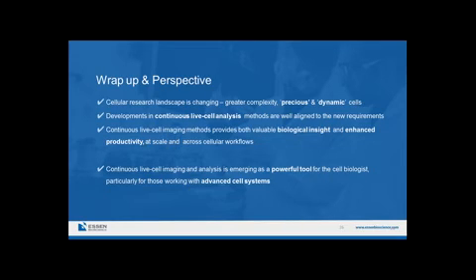The continuous live cell imaging methods I showed you provide both valuable biological insight as well as enhanced productivity, and this can be done at scale and across a range of different cellular workflows. My concluding statement is that continuous live cell imaging and analysis is strongly emerging as a powerful tool for the cell biologist, particularly for those of you that are working with or considering working with more advanced cell systems. So on that note, I will finish up.